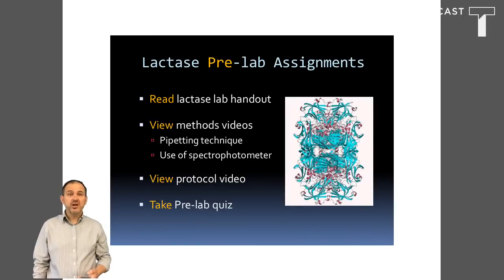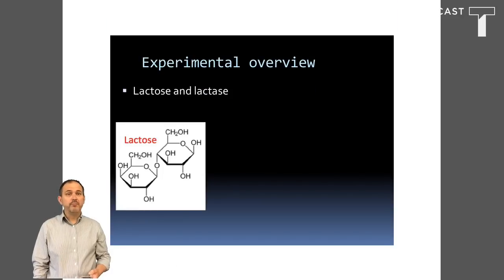For the pre-lab assignment, you should read the Lactase handout, view the methods videos on pipetting technique and the use of a spectrophotometer, view the protocol video, and take the pre-lab quiz. Following that, you'll actually perform the lab, which brings us to the experimental overview.